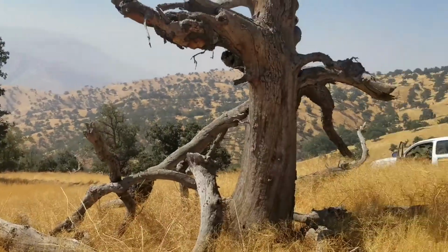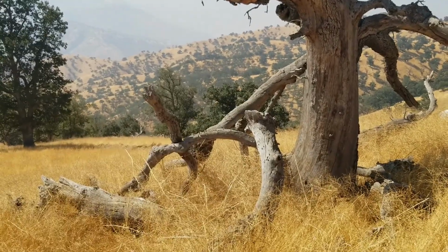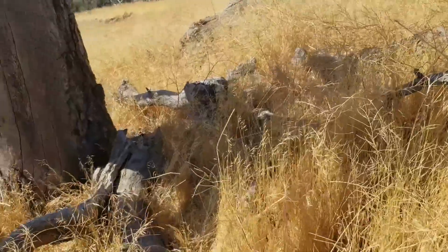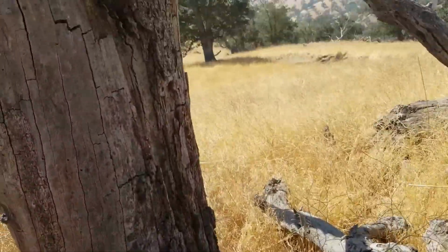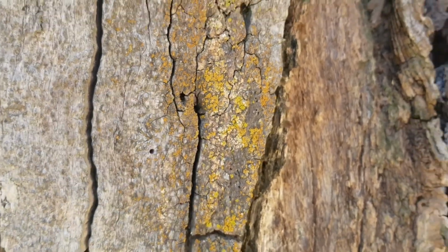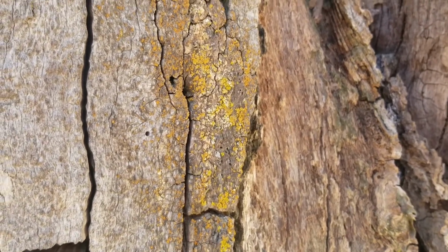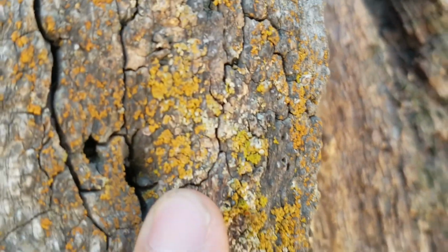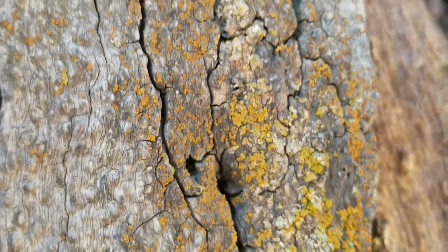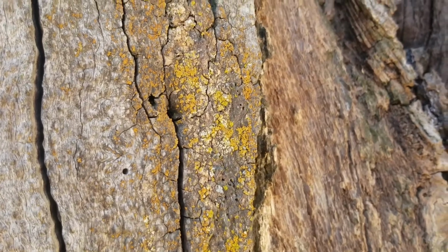But I'm going to really quickly show you how you might narrate this week's lab assignment, which is today I'm a microbiologist, using your portable microscope. There's this dead oak tree right here, and I noticed there is some lichen growing on it. You see this orangish yellowish stuff? That's lichen, which is actually a community. Remember, a community is a group of different populations in the same place at the same time, and lichen is a community of algae as well as fungi. So it's not a species, it's a biological community we're looking at on the surface of an oak tree. I thought it'd be interesting to see what it looks like under the portable microscope.